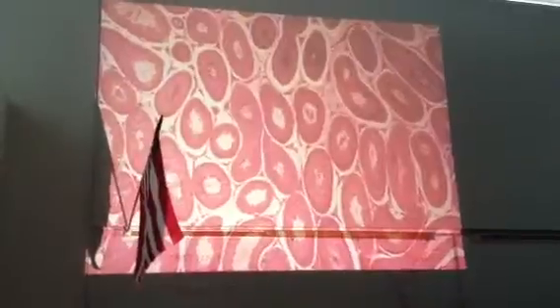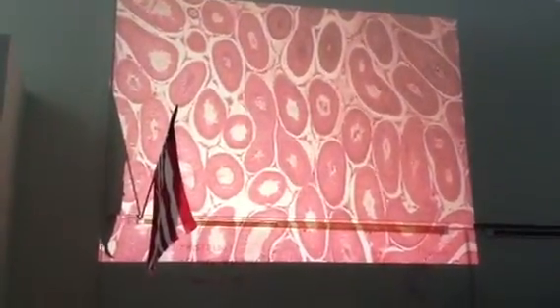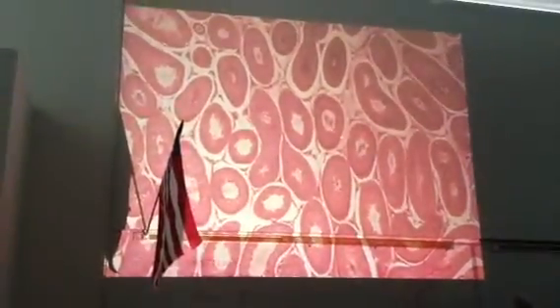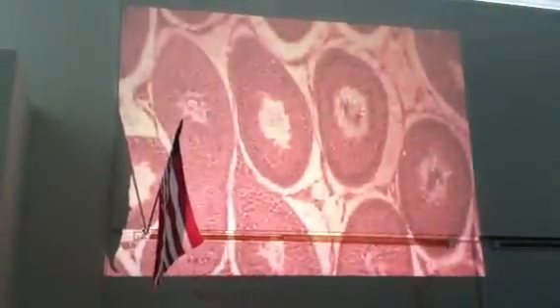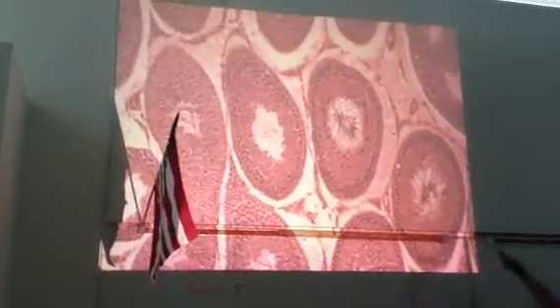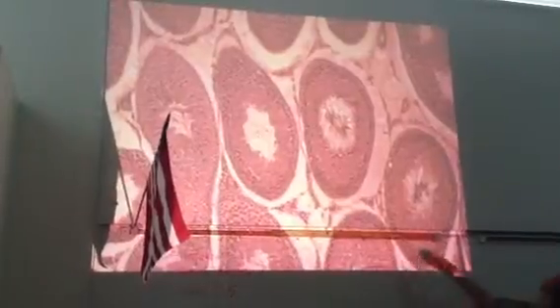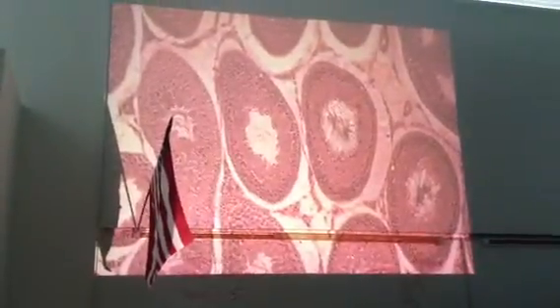Okay, this is a section through the compartment of the testes. It's a single tube that winds down and back, and it's called the seminiferous tubule. That's where sperm cells are produced in the male. And the heads of the sperm cells are the dark profiles you see right here. The tails are the flagella that are sitting like this. So that's the seminiferous tubule. The cells to the outside here are called interstitial cells of Leydig, and they produce testosterone in the male.